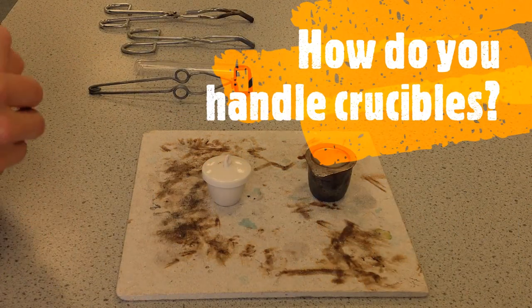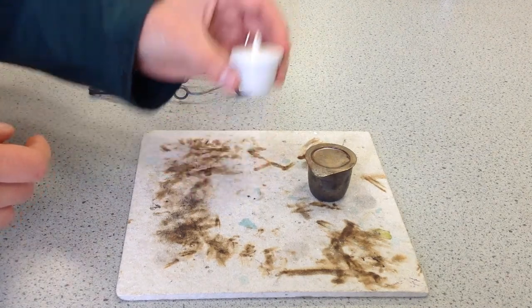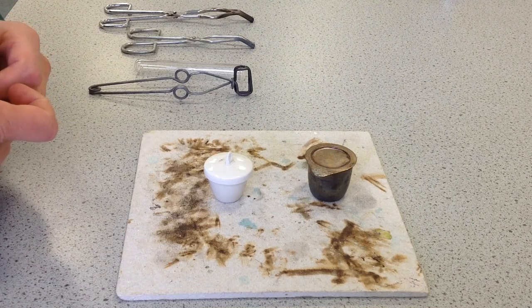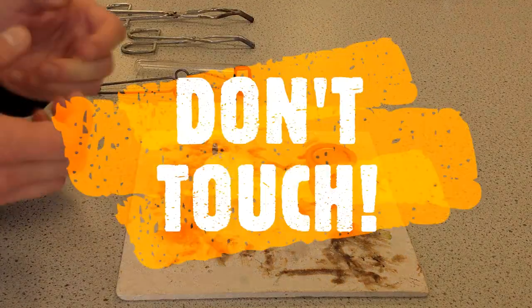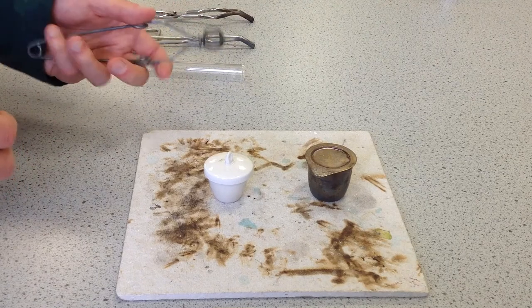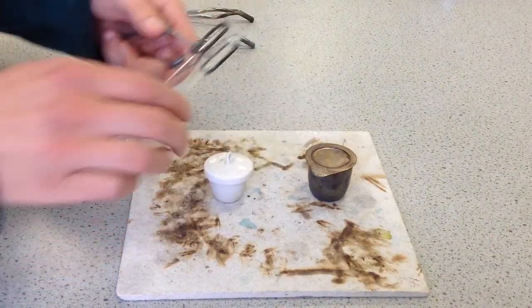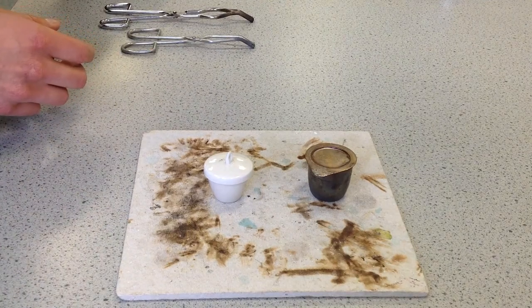How do you handle crucibles? Well, when they're cold, there's nothing wrong with using our fingers in order to pick up and put crucibles down. But as we're going to be heating substances to a high temperature, we need to know how to handle these safely when they're hot. The golden rule here is: do not touch. Another very important thing is to use the right tools. These are test tube holders — they're designed for holding test tubes, not for holding crucibles.